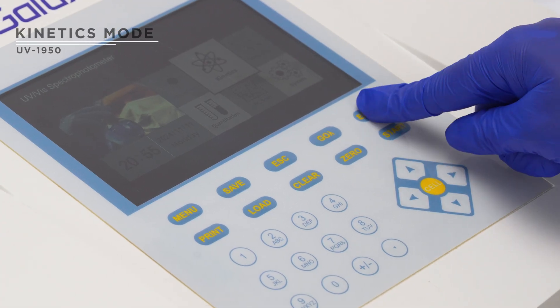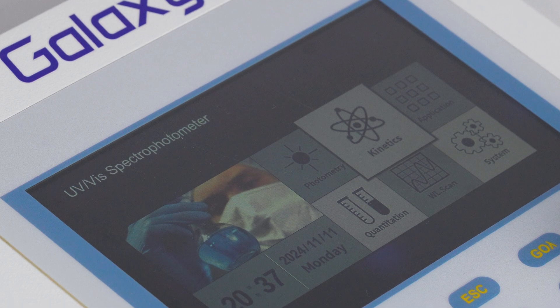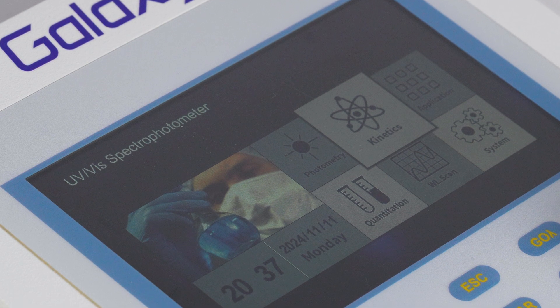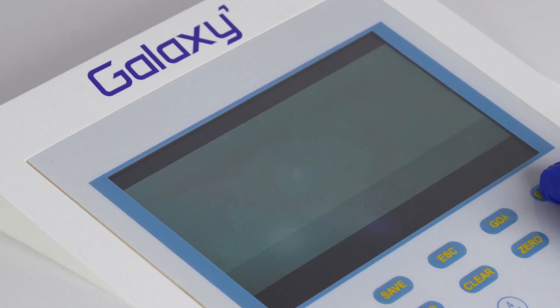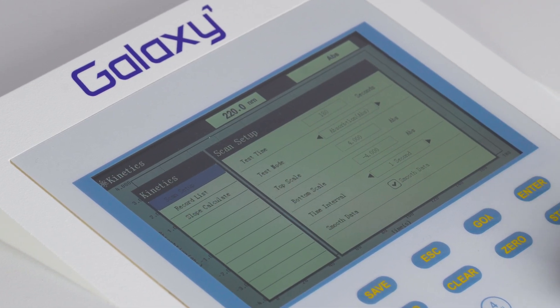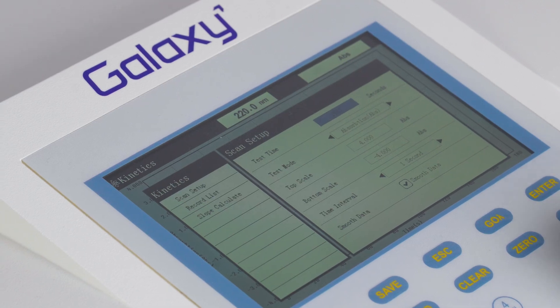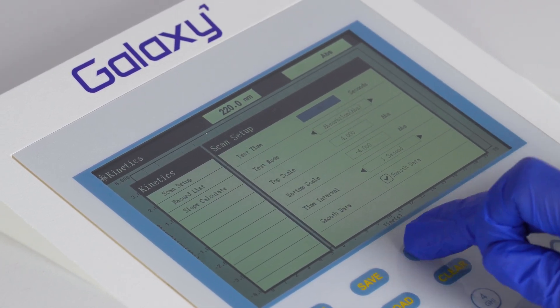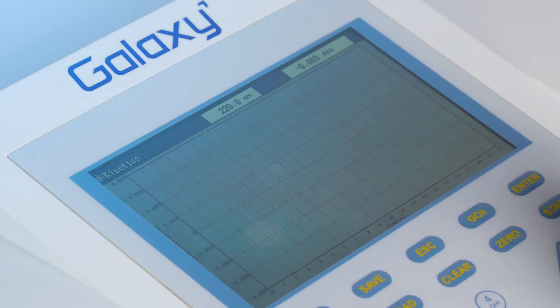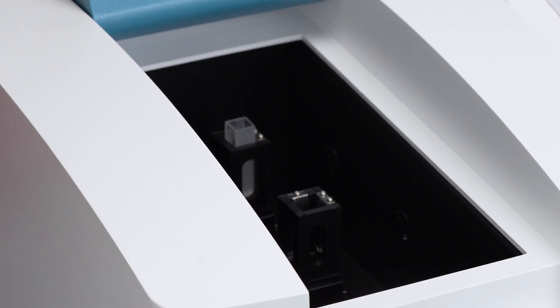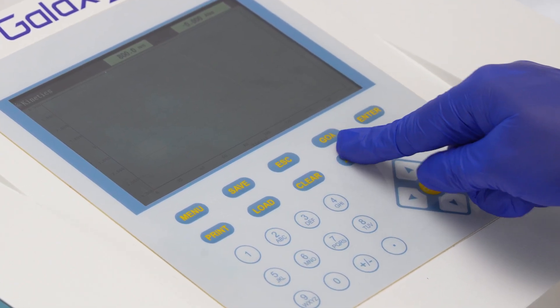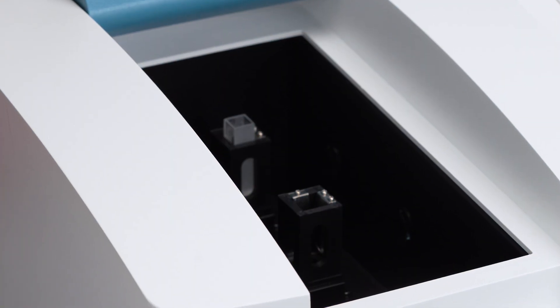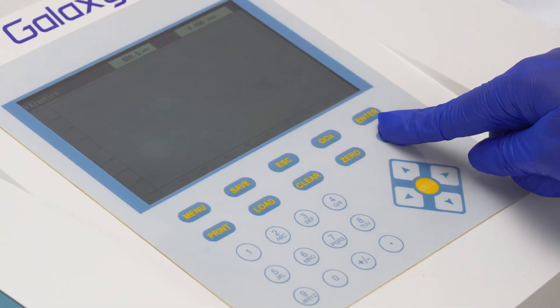In kinetics, the kinetics mode plots a curve of absorbance versus time. Select kinetics from the menu. Input the parameters in the dialog box and press escape to save. Place blanks in both holders and press zero for blanking. Insert the sample and press start to record the reading.